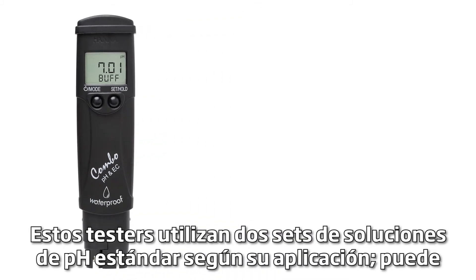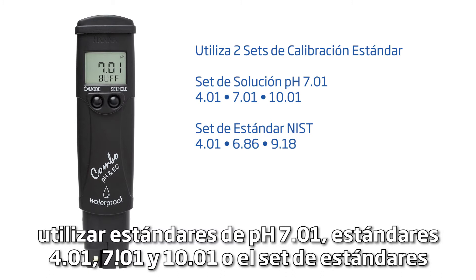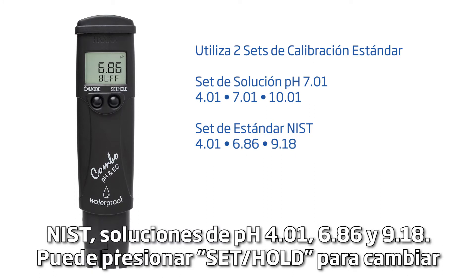These testers use two sets of standard pH buffers. Depending on your application, you may use the pH 7.01 buffer set — 4.01, 7.01, and 10.01 buffers — or the NIST buffer set: pH 4.01, 6.86, and 9.18 buffers. You can press SET HOLD to switch between these two sets.